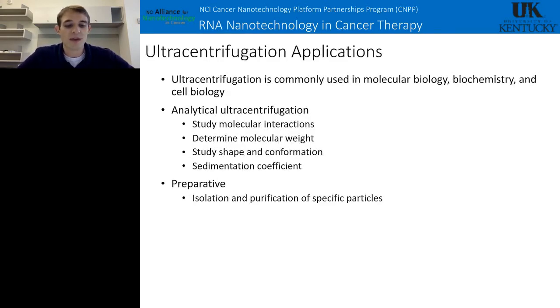So now, just some applications of ultracentrifugation. Ultracentrifugation has very wide applications in many labs, especially those that do molecular biology, biochemistry, and cell biology. Ultracentrifugation can be broken down into two different areas: analytical ultracentrifugation and preparative ultracentrifugation.